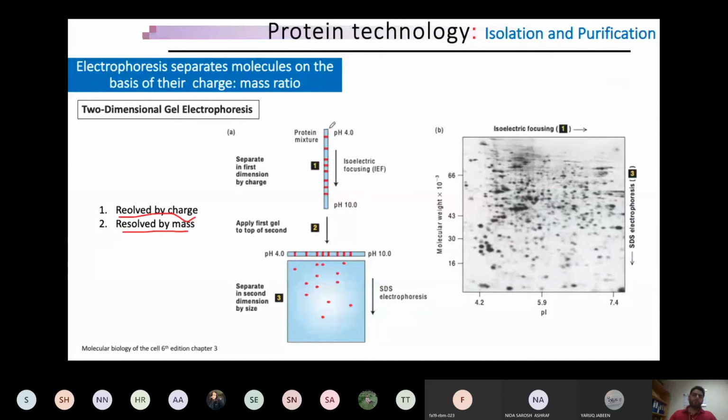So this type of strip is commercially available, and it is made by taking a mixture of ampholytes. For example, majorly positively charged ampholytes and negatively charged ampholytes, and then you mix them, so this will create a gradient. It might be that positively charged ampholytes are at one end and negatively charged ampholytes at the other end.